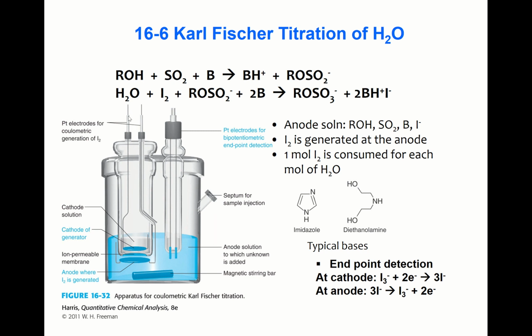By applying the potential at the anode, iodine is generated. And this one more iodine, one more iodine now consumes one more water. Okay, you understand?